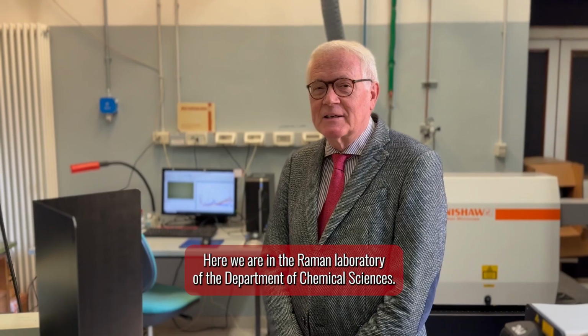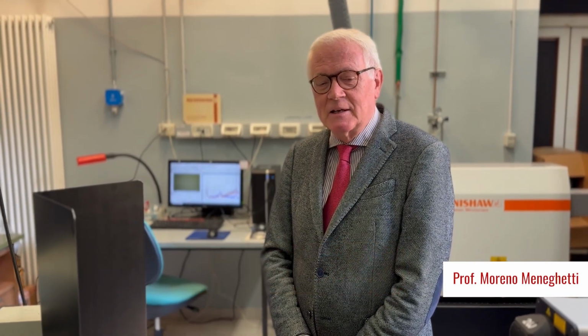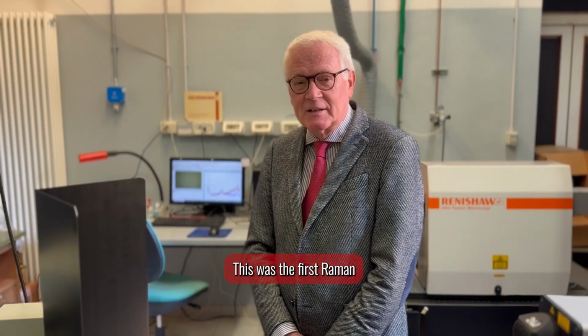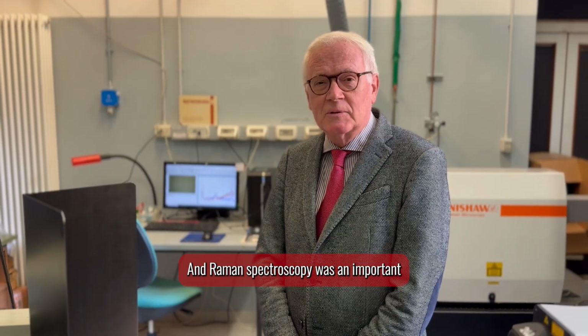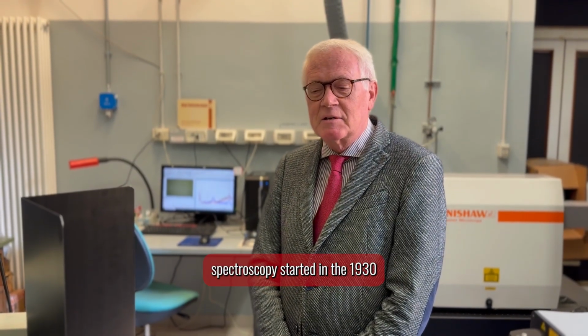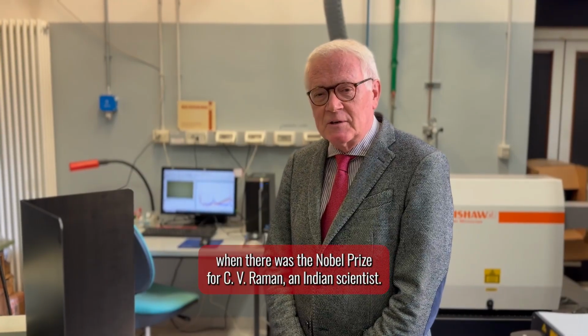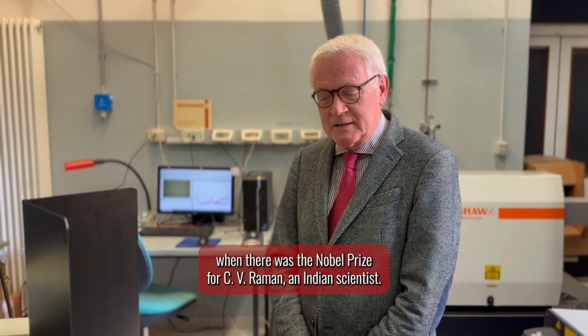Here we are in the Raman Laboratory of the Department of Chemical Sciences. This was the first Raman Laboratory here in Padua, at the university. Raman Spectroscopy was an important spectroscopy. It started in 1930 when there was the Nobel Prize for Raman, an Indian scientist.